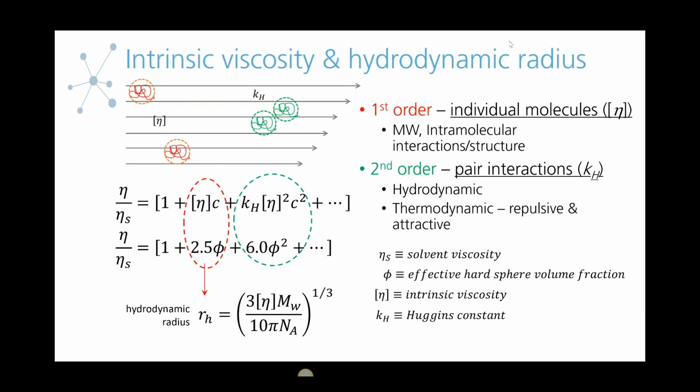Okay, we just had one more question, where they're asking, can we use our extensional flow channel on the Initium? At this time, we don't have that option available. Right now, we can only use our extensional chip on our VROC system, the manually operated system. So at the moment, no, we don't have that option available.